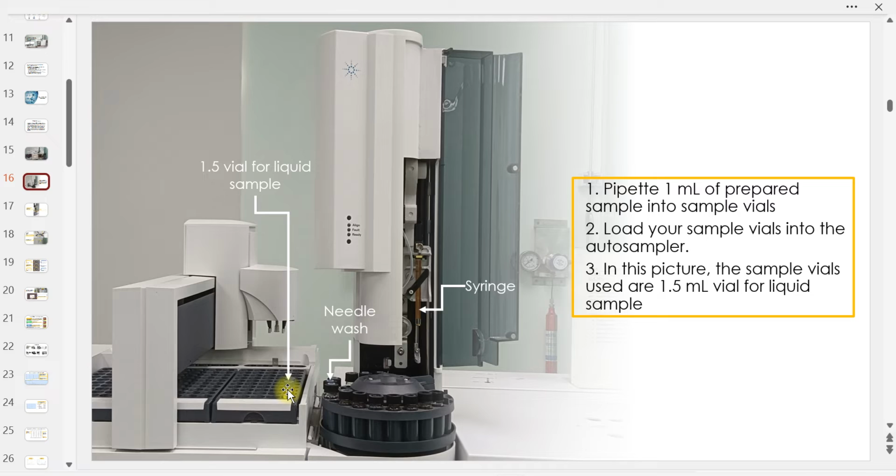Kita boleh pakai headspace. Kalau you want to know a composition in a compound, we go for liquid. Headspace boleh sample solid, no problem. Cuma kalau sample tu solid, it should be volatile lah. That's why compartment for the headspace, they have the heater. Dia boleh panas.